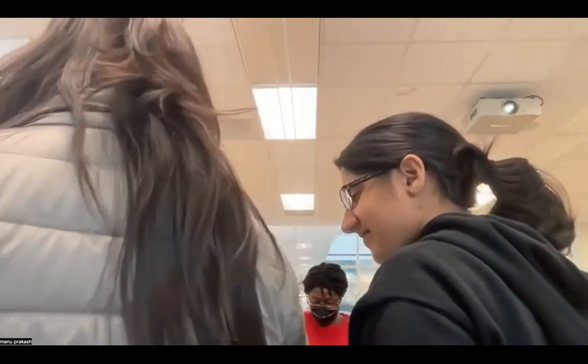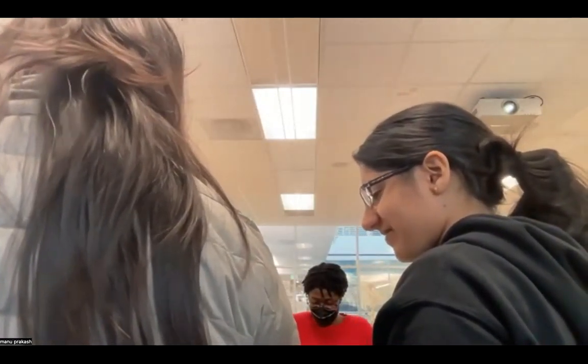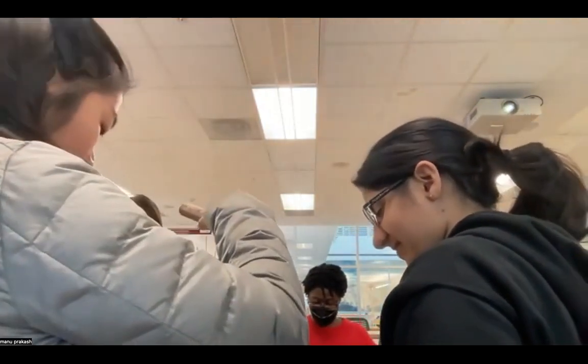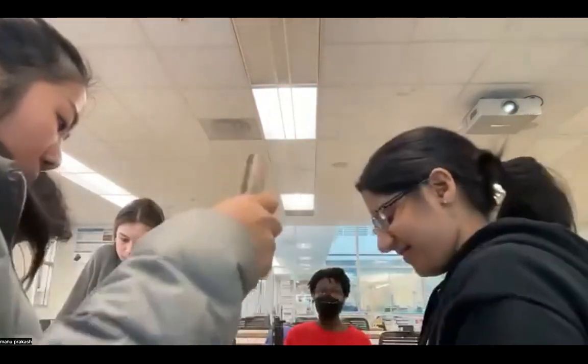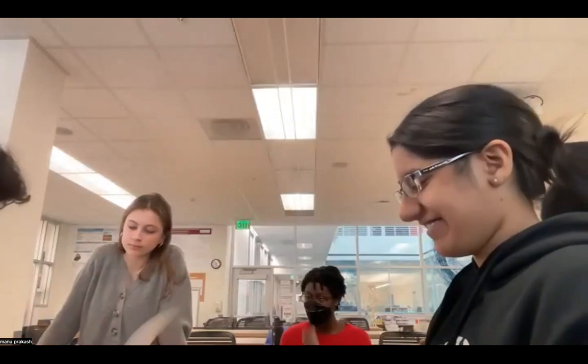I'll cut that. Okay, so we mounted that. And you can see why that is important, because we don't want that to fly off. It's better actually. And when I send you the protocols, I'll send you a very specific tape. This is not really the perfect tape either.